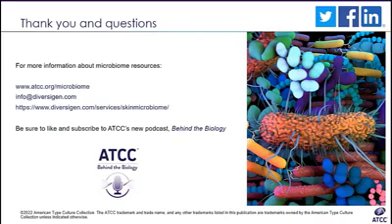Yeah, so that's a very important question. As I mentioned during the webinar, one of the main disadvantages of skin samples is having high host DNA and lower microbial content compared to other sample types like, let's say, stool samples. The main issue is that the more host DNA you have, the less microbial DNA you'll get. I would say that one of the main ways to avoid this is by optimizing your DNA extraction method to enhance and get more microbial DNA.